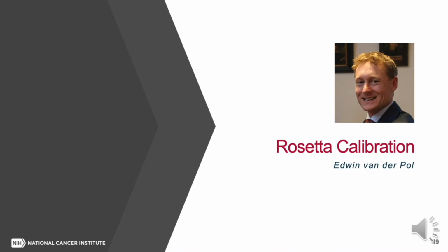So I'm now going to hand over to Edwin van der Pol, who's going to take you through the Rosetta Calibration software.